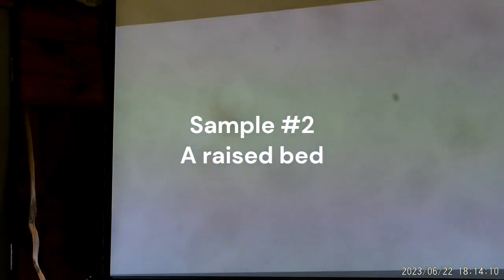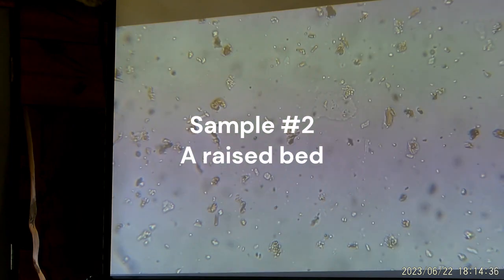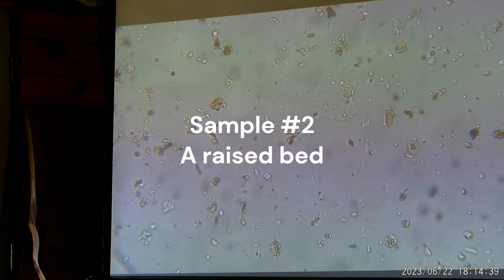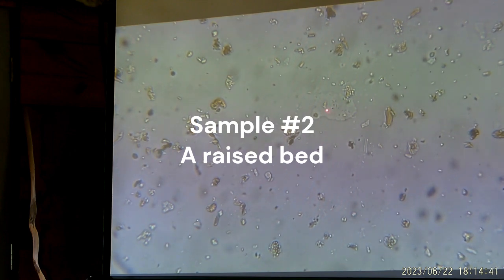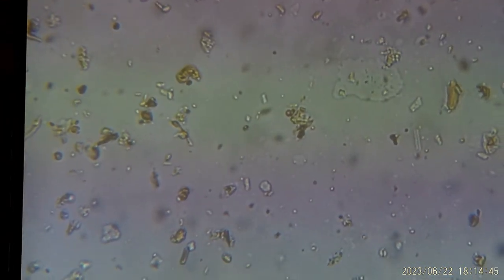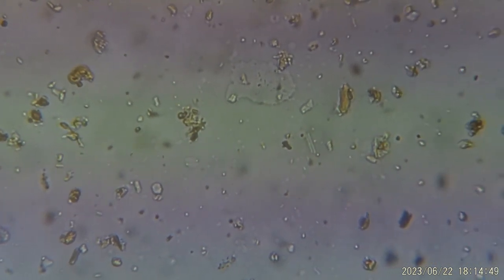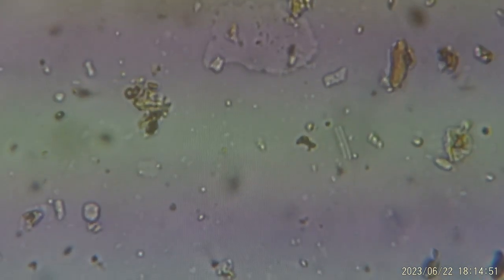All right, so this is the other sample that we have here. I'm just going to zoom in really quick because I saw some movement over here. That's interesting. What you're seeing there is a type of amoeba. This is a naked amoeba. The ones that we saw previously actually had some shells around them. They create these shells from their environment. Whatever's in their environment, they would create that shell.